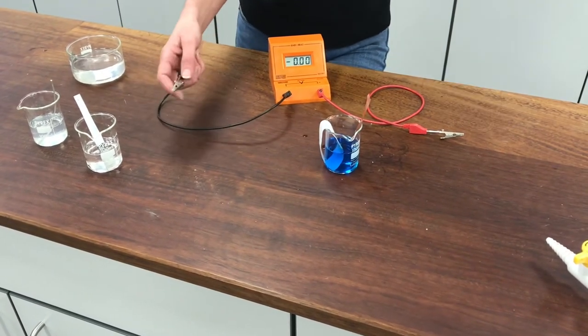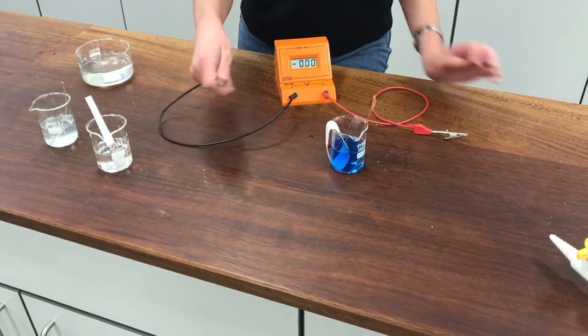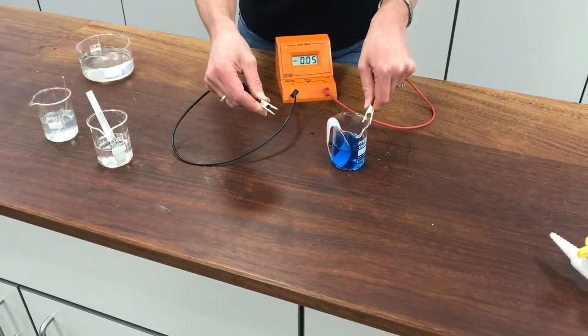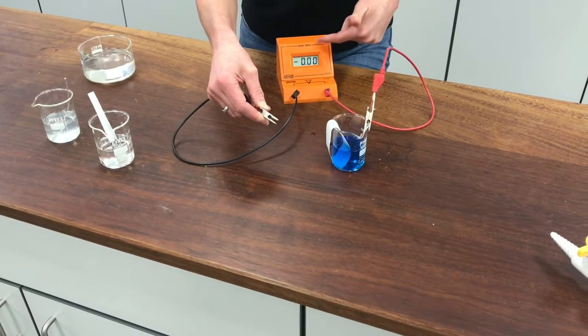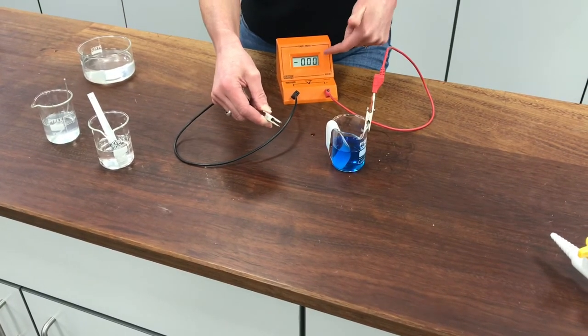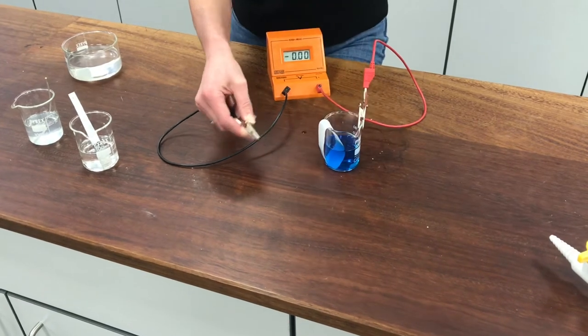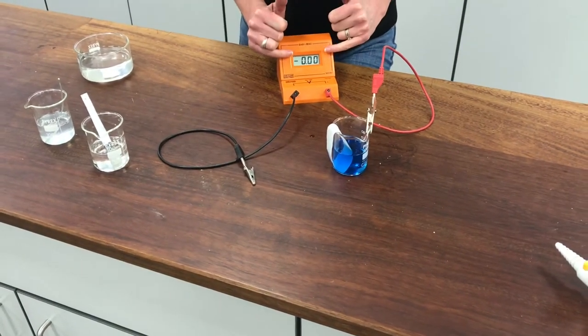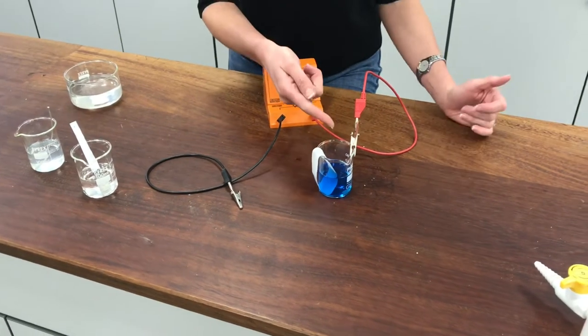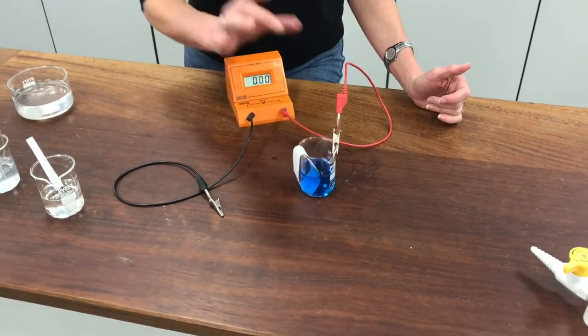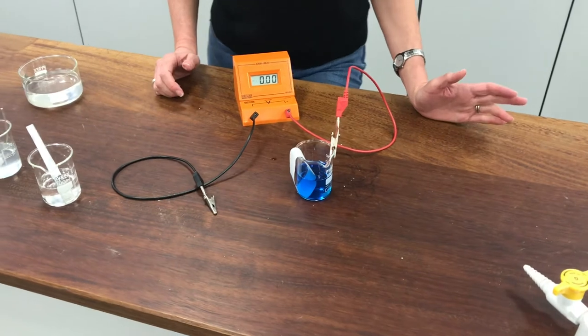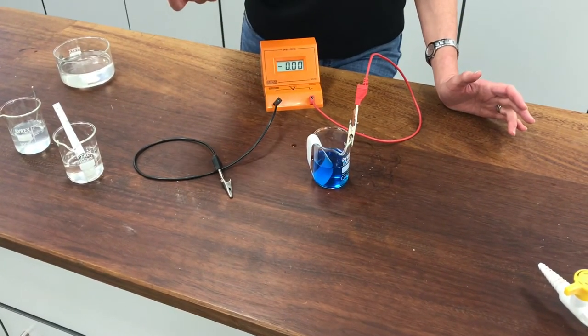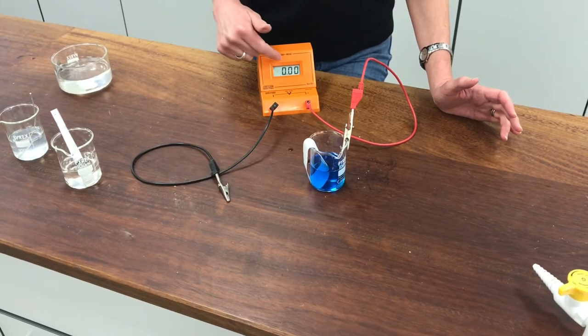But once I've done all of that, I could then connect that up to my setup here and I could take a reading for the potential difference of my half cell compared to hydrogen. If the voltage came out as being something negative, that would tell me that this half cell was better at producing electrons than my hydrogen half cell, so effectively it would be a better reducing agent.